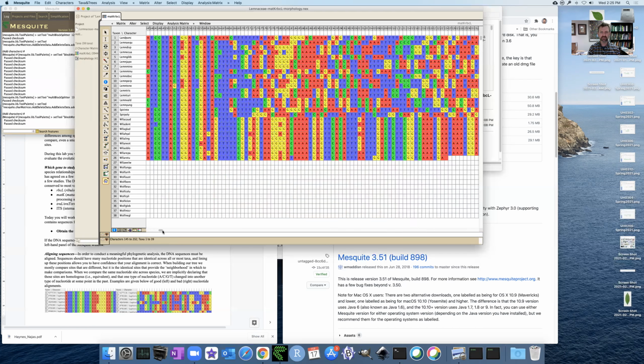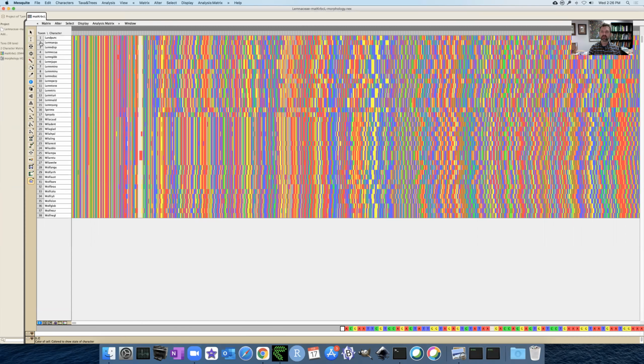If I look farther along at this cumulative difference, I still see some patterns. So it looks like this block of A's, or sorry, T's is pretty similar across a lot of those sequences. I could probably get this to align okay. One feature I like is you can zoom way out. There's a feature called the bird's eye view. You can get that here or on the display menu. I'm just going to click on the little bird, and that zooms us way out. And we can see that we started with some good alignment, these bands of the same color. But then we get into the point where kind of a cute little artistic pattern emerges.